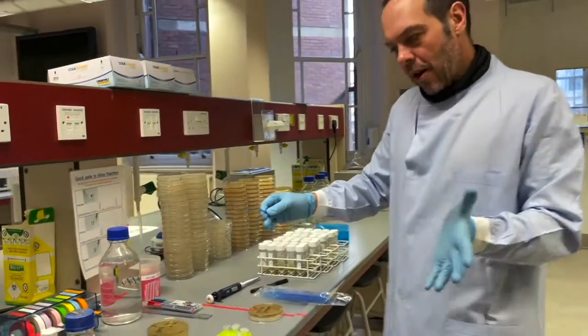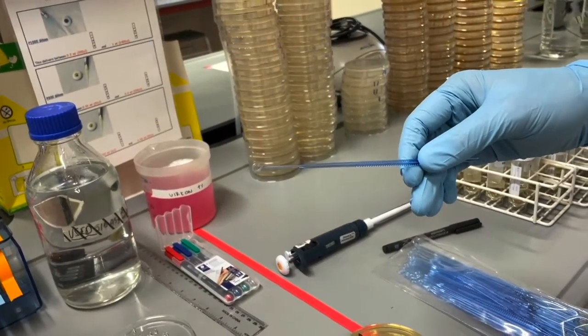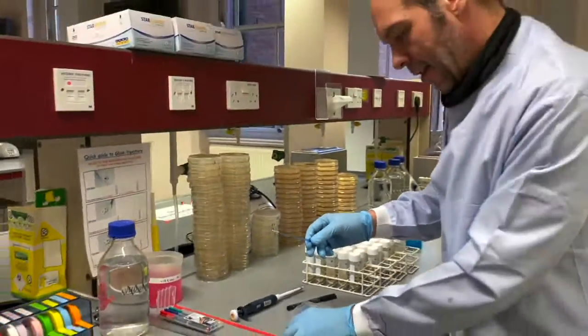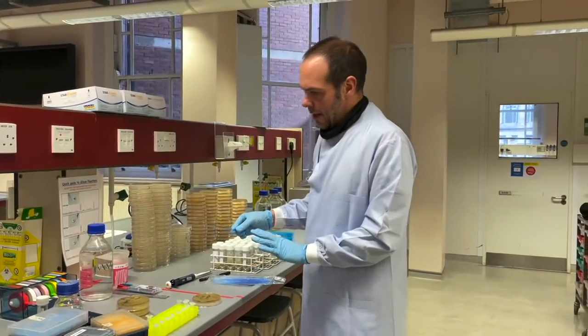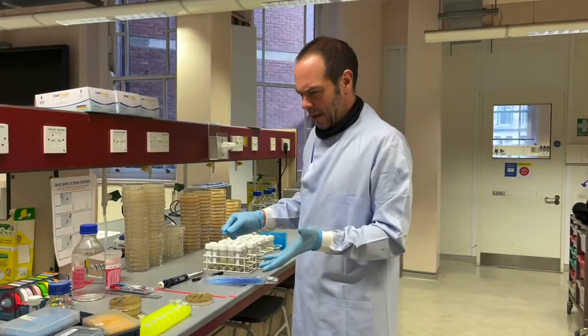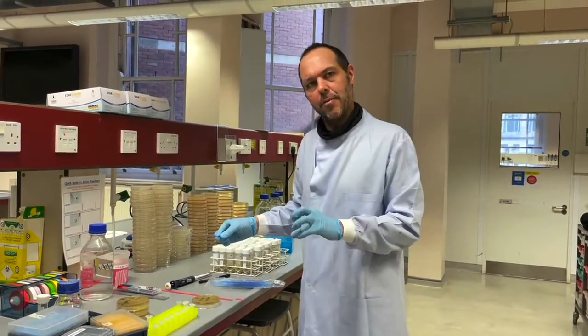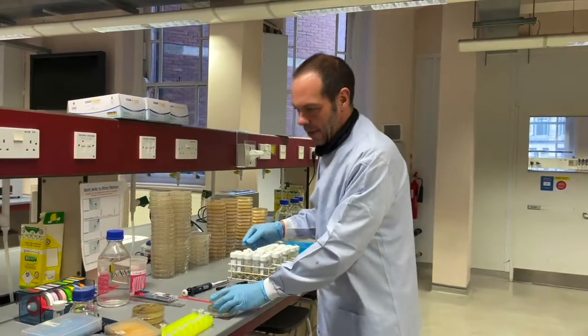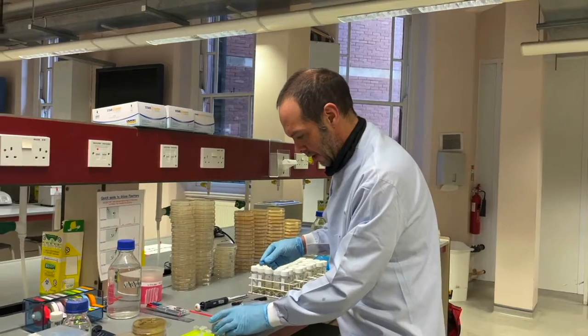Now, again, there are lots of ways to do this. I don't know if we'll be able to see on the video. It's not very clear. Anyway, there are lots of ways to do this, and with practice, you'll probably find your own way. The way I've described in the protocol and the way I'm going to show you is perhaps the most reliable, but it doesn't necessarily give you the largest number of single colonies. So again, we're going to do a dilution, but it's a non-quantitative sort of dilution.